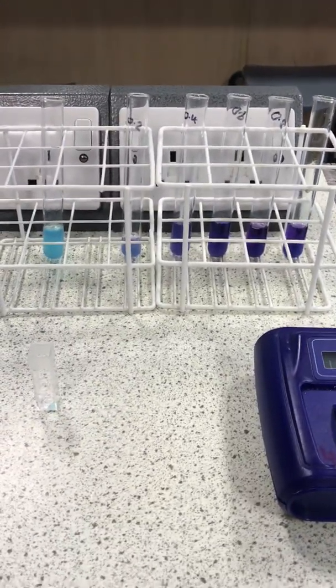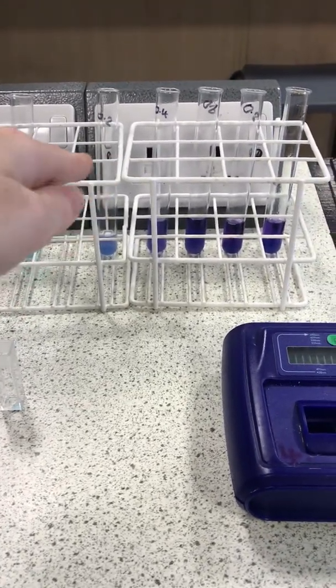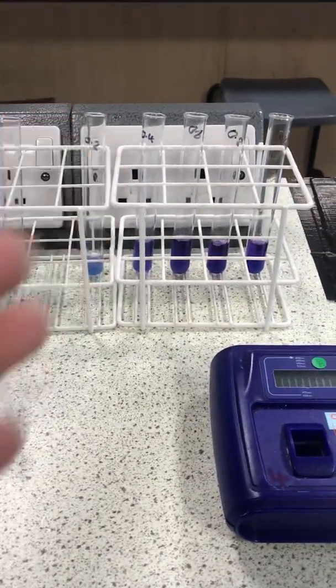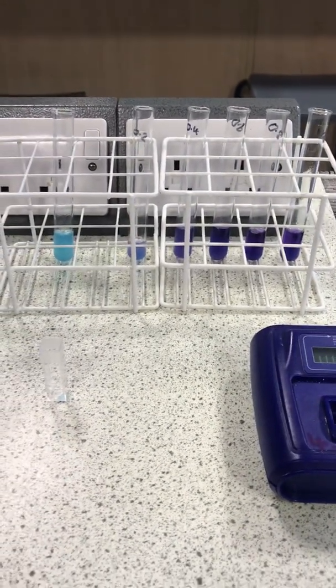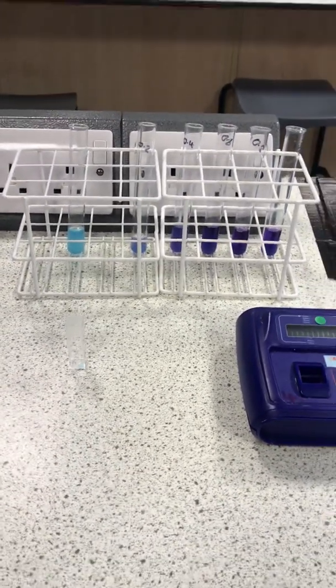Now, already as we're sat here, we are generating data by eye. We're comparing the intensity, and we can see that the intensity is increasing as we go from the lower concentrations up to the higher concentrations. However, that is subjective. In other words, it's our opinion. So we're going to generate the data, as we've talked about, using the colorimeter.